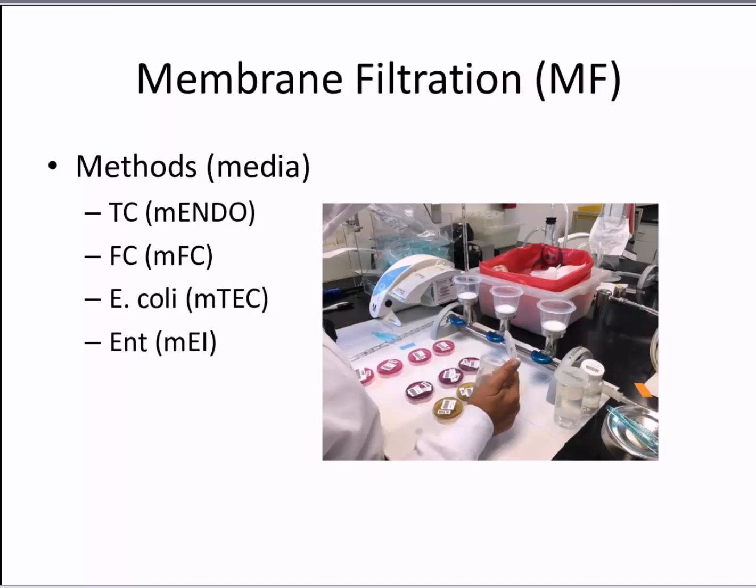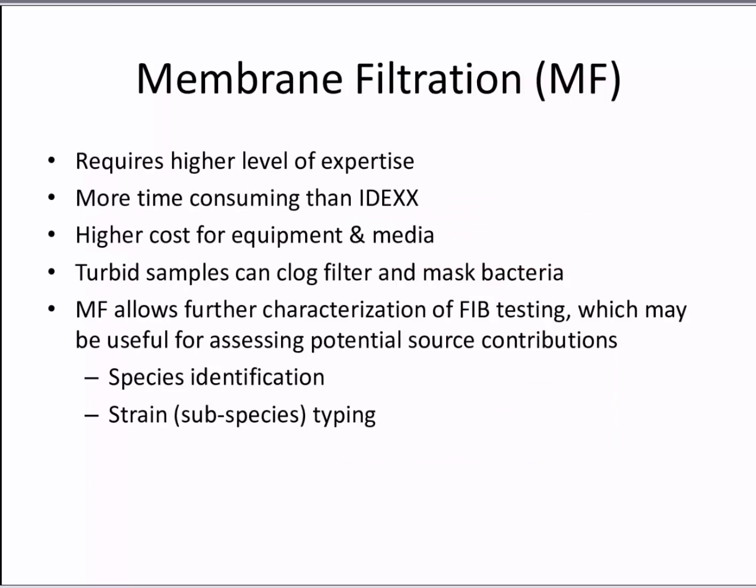Okay, so the membrane filtration method may not be as widely used because it requires a higher level of expertise. It's more time-consuming than IDEXX. There's a higher cost for equipment and media. And there are problems with turbid samples, which can clog the filter and actually mask bacteria.